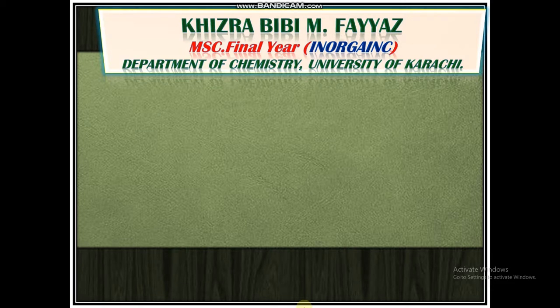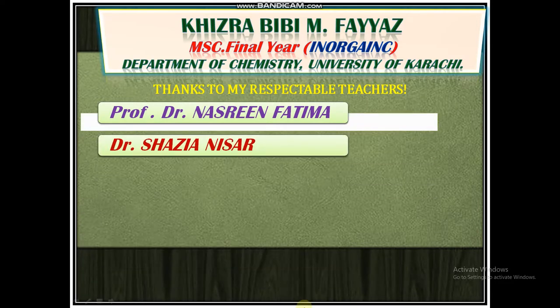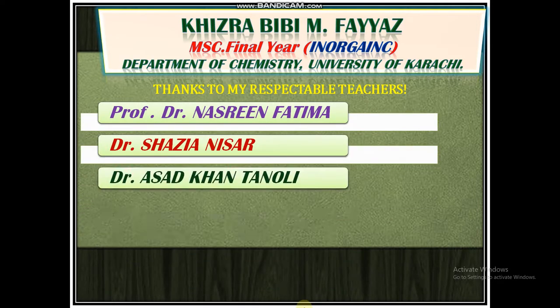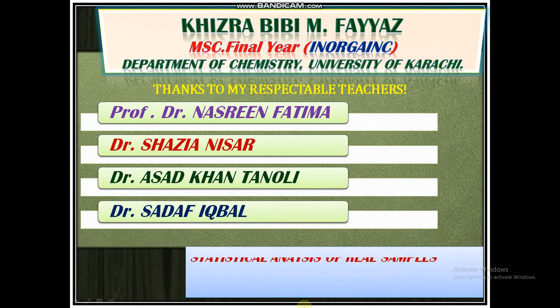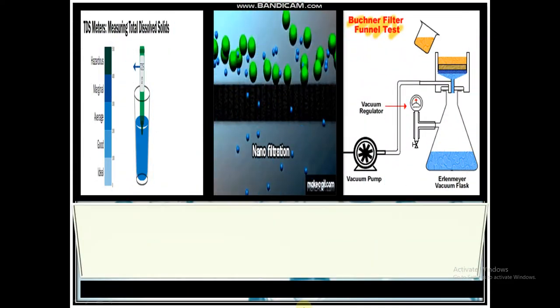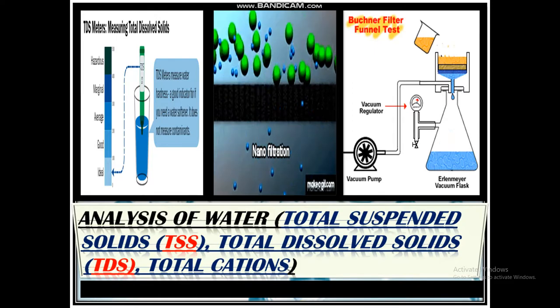Khizra Bibi Muhammad Fayyaz, student of MSc Final Year Chemistry, would like to thank my respected teachers, Professor Dr. Nasreen Fatima, Dr. Shazia Nisar, Dr. Asad Khan Tanoli, and Dr. Sadaf Iqbal for giving me this opportunity to portray my talent regarding my presentation topic, that is analysis of water for total suspended solids, total dissolved solids, and total cations.